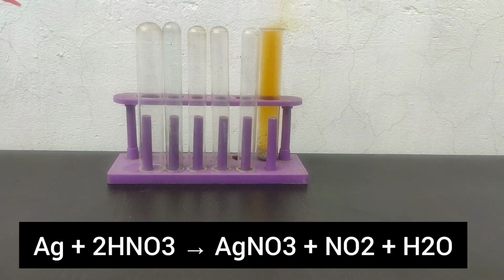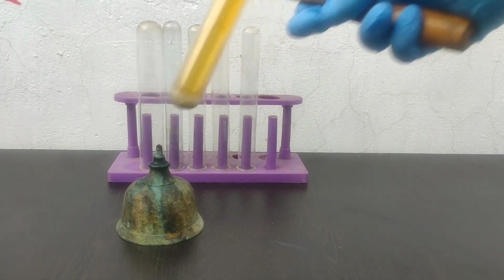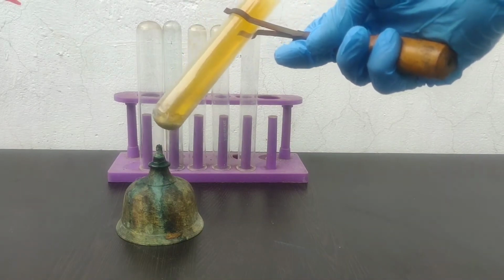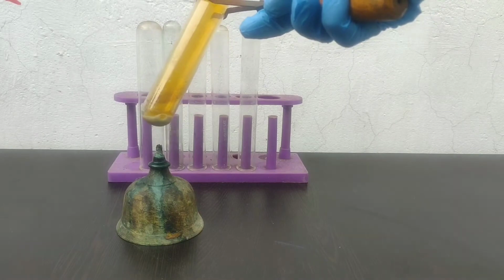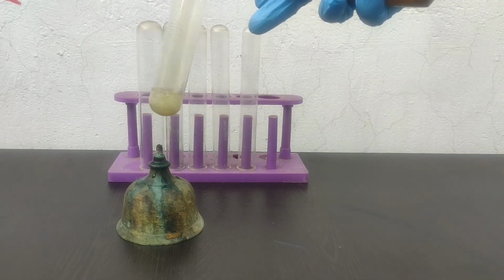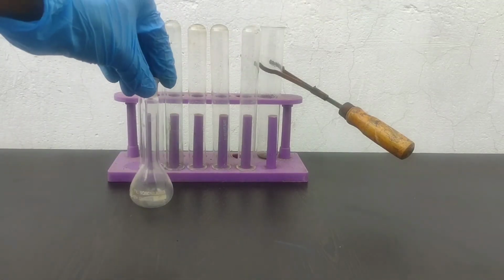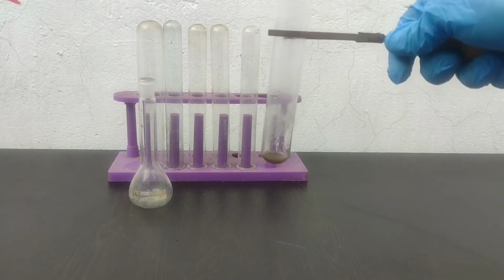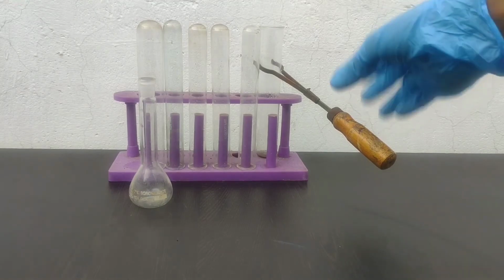Silver reacts with nitric acid to produce silver nitrate, nitrogen dioxide and water. To dissolve the silver completely, I heated it. On heating, all the silver dissolved. I continued heating until all the silver dissolved. So after all the silver was dissolved, I took a 25 ml volumetric flask and adjusted the volume of the solution to 25 ml.